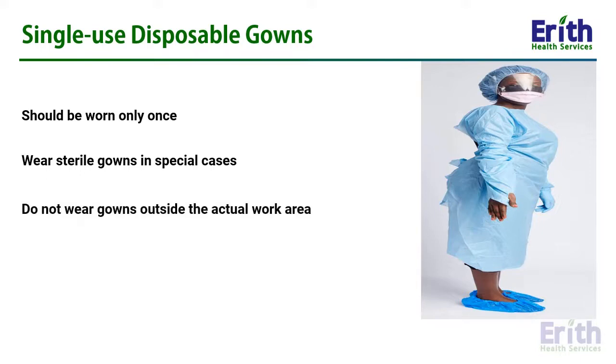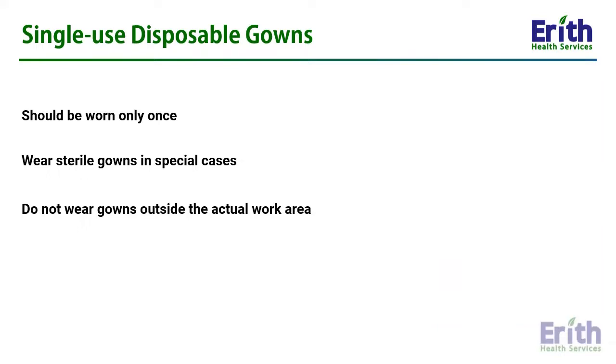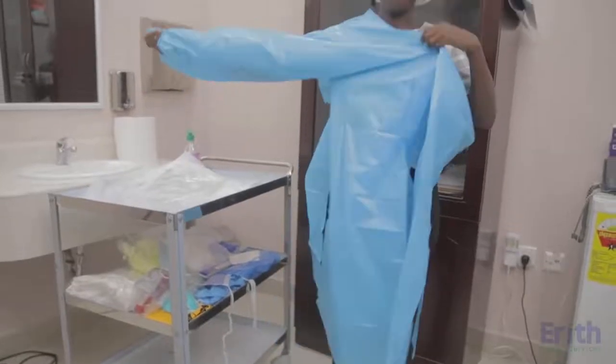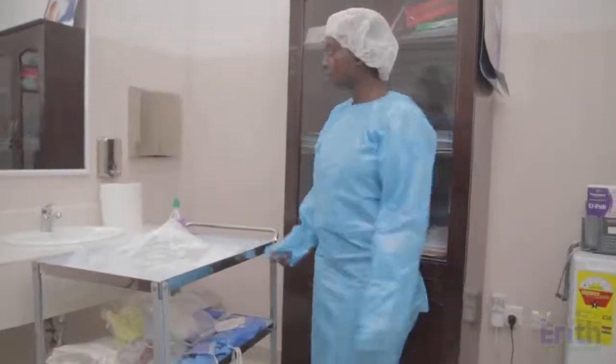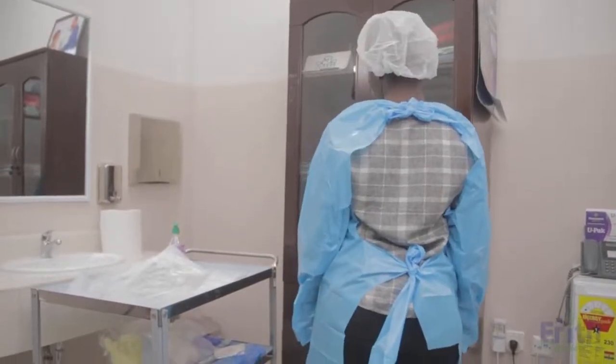Gowns shall never be worn outside the actual work area. Wearing of single-use gowns. Select the appropriate type and size. Opening may be in the back or front. Secure at neck and waist.